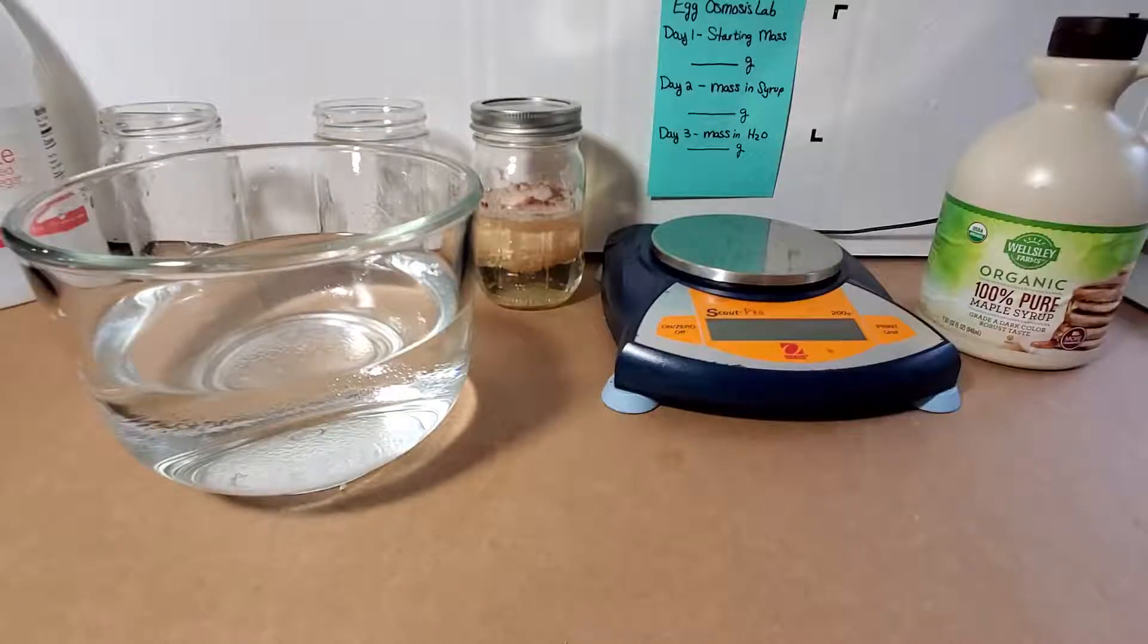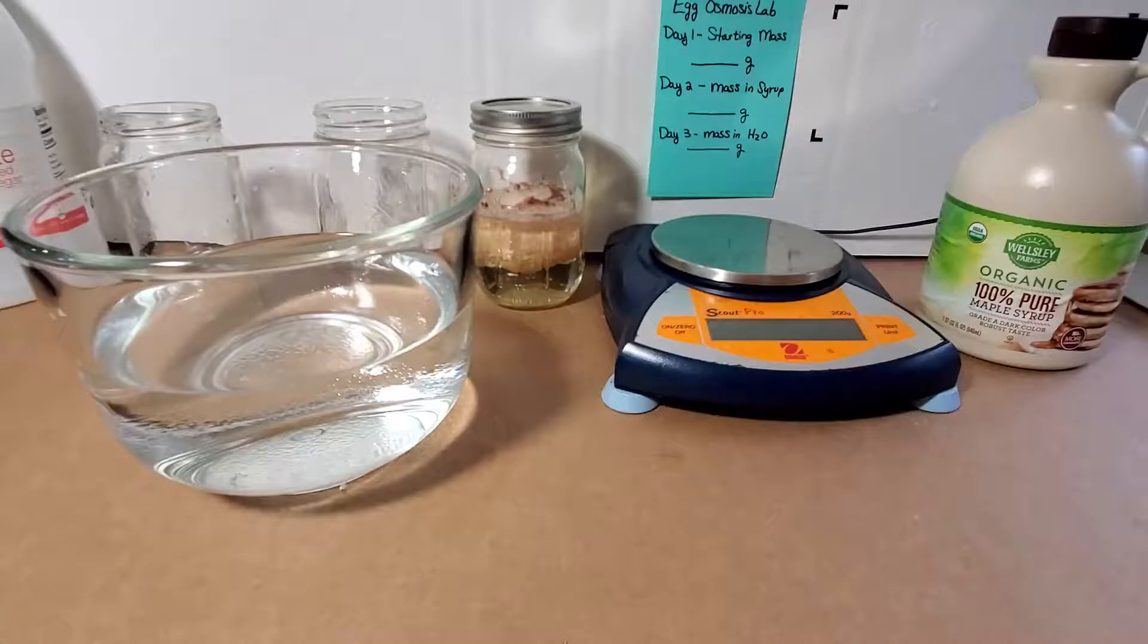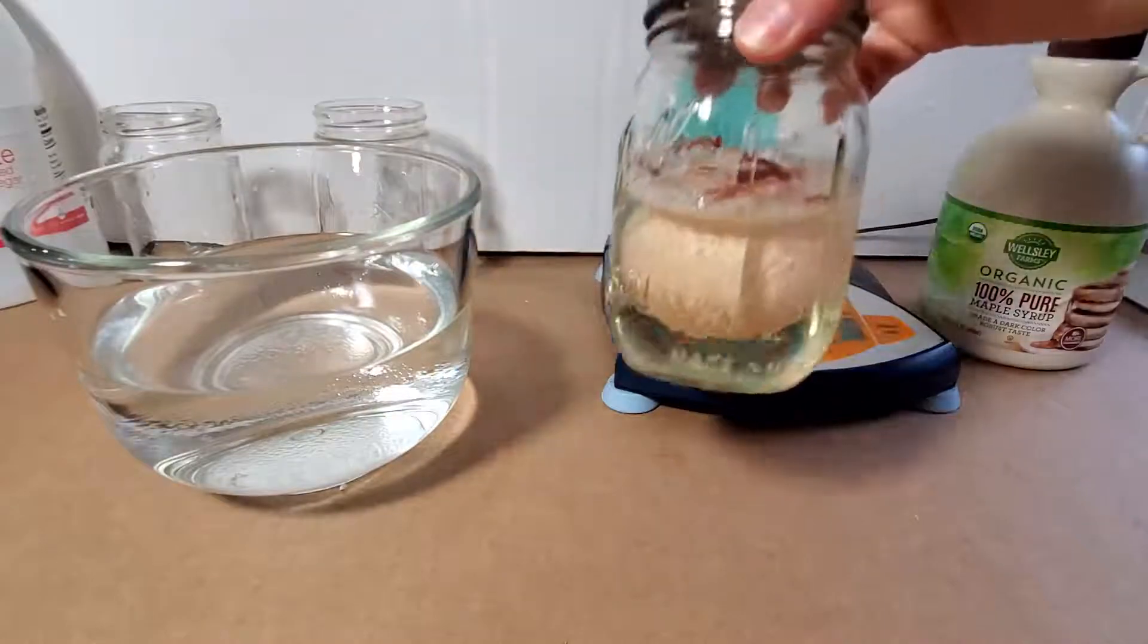Good morning and welcome. This is Mrs. Rowe and this is part of our biology class at home series. Today we are going to be looking at our egg osmosis lab and we are going to be looking at how our animal cell responds to changes in solution concentrations in its environment. This lab is going to be used more specifically to be adding more vocab as we are going through understanding how materials can be transported in and out of cells.